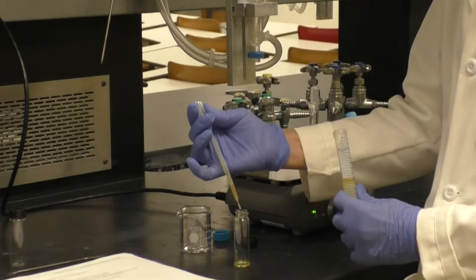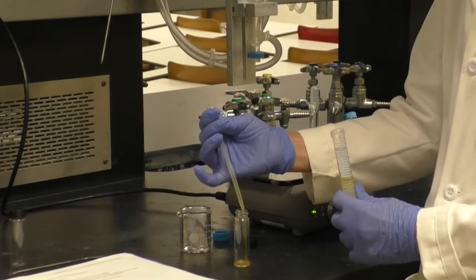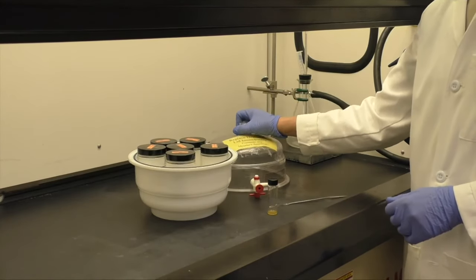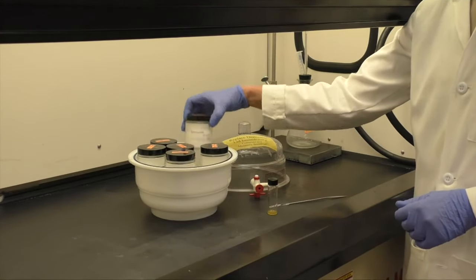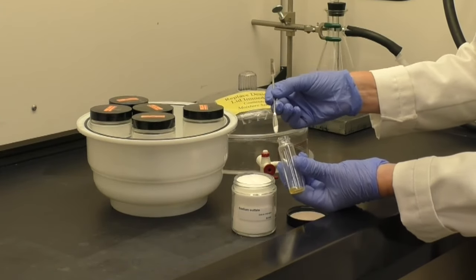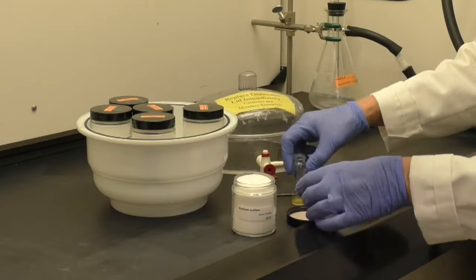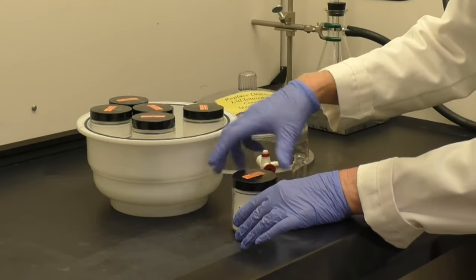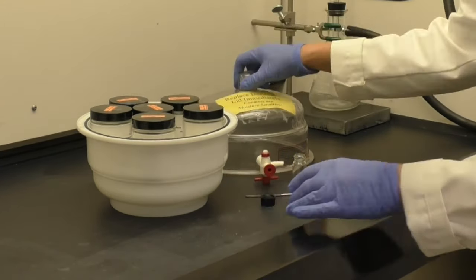Weigh the vial containing the eugenol and record the mass. In order to remove any remaining water, add a small spatula tip full of sodium sulfate. Be sure to label the vial as eugenol. This is your product which you will further analyze.